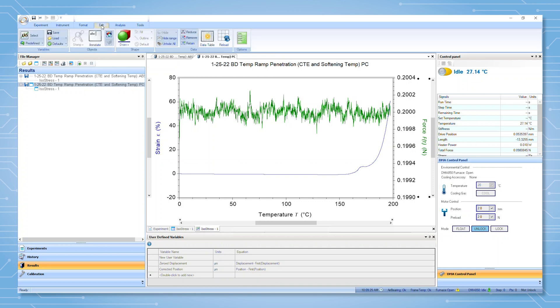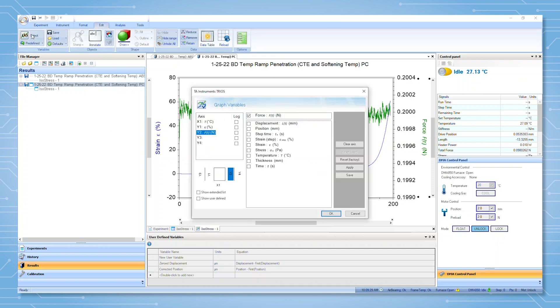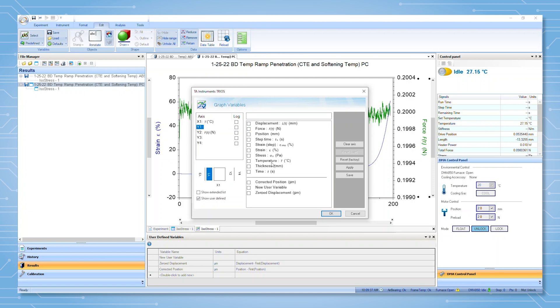The user can then go to the plot view and select plot variables. By clicking the show user-defined variables option, the user-defined variables list will be enumerated, and the user can plot these.